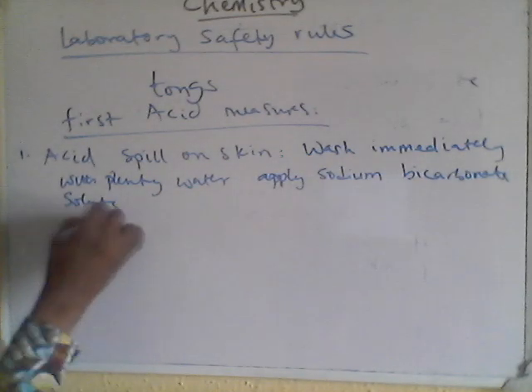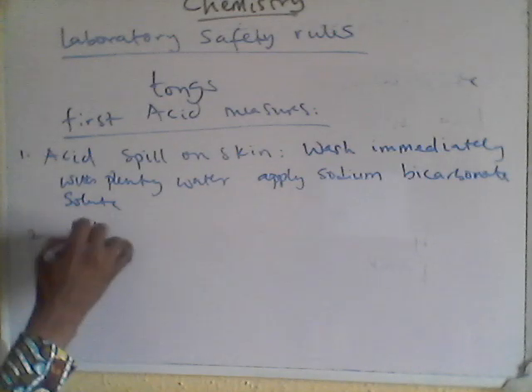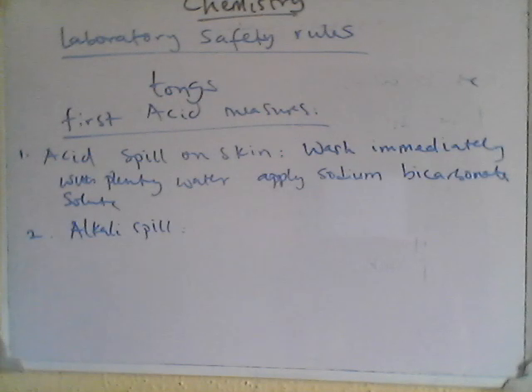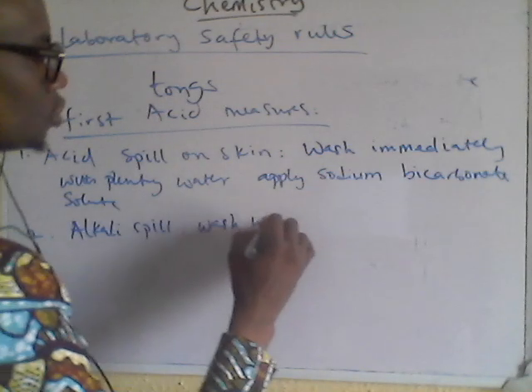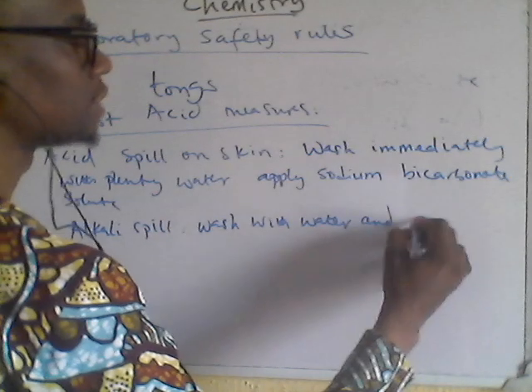Number 2, if you have an alkali spill on your skin, you wash with water and apply dilute vinegar.